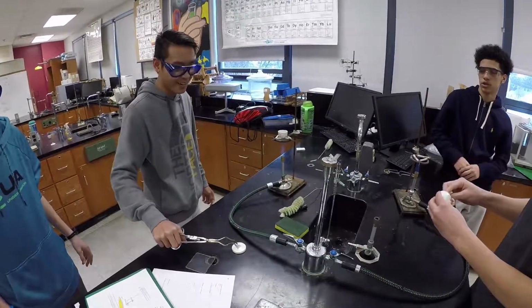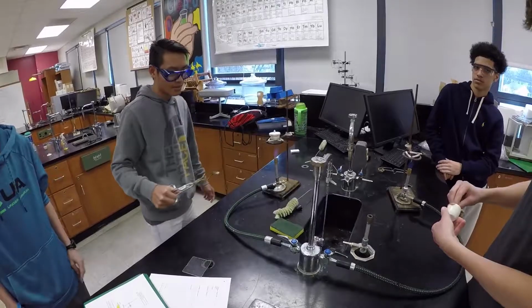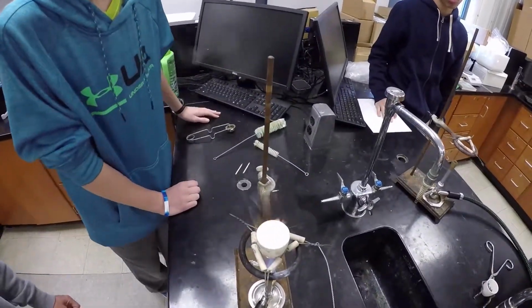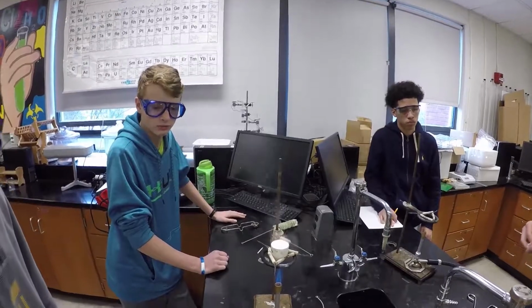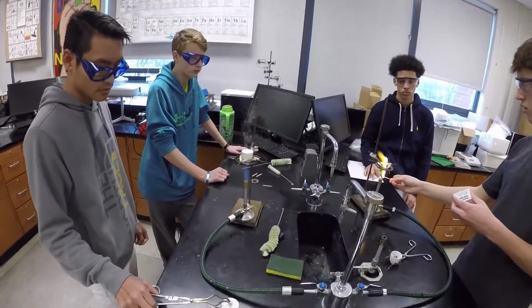Did we turn the gas on and then set it on fire? Yeah. Taking the lid off, then we'll cause it to ignite. As you can see. Now you're only going to leave the lid off for about a minute, and then you'll put it back on because you don't want the ash to get blown out of your crucible.